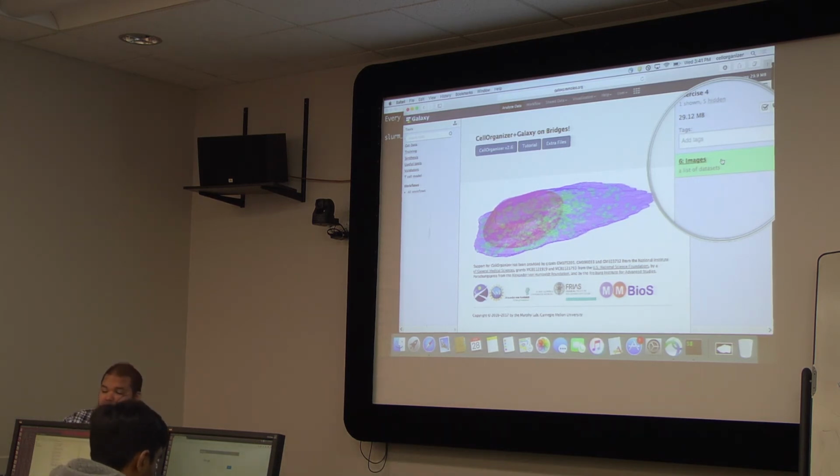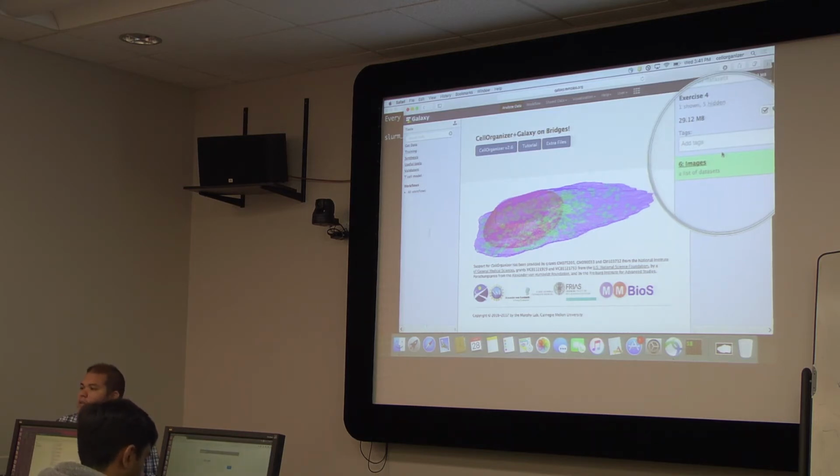Now, to give you an example, I've been training a model that has about 1,000 images at full resolution for about how long, Shantao? 45 days now? It's about 1,000 images. So computing this pairwise computation can take a really long time. Okay, so that's why we're only selecting 5 images. We want to get some results today.